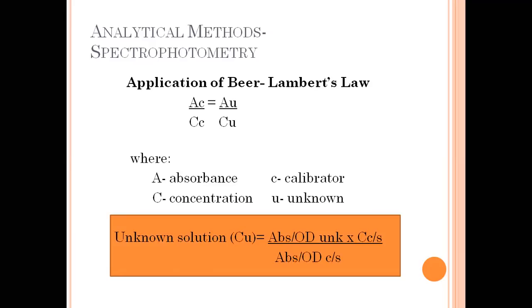Since that is a calibrator or a standard, it already has a concentration set by the manufacturer. Depending on the method and the manufacturer is the concentration of the standard or the calibrator. You are not the one who will find that. Whenever we proceed with analyte measurement, that is always given.